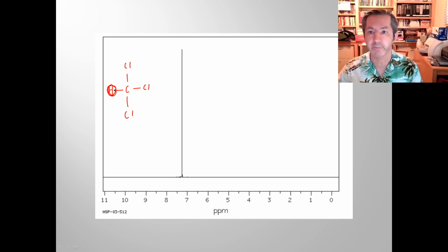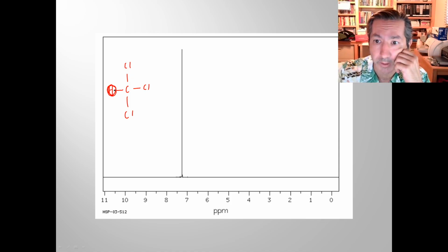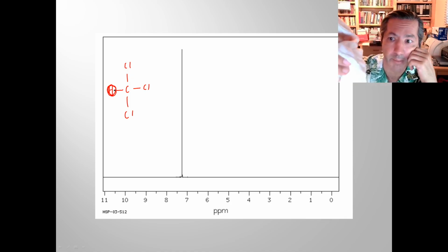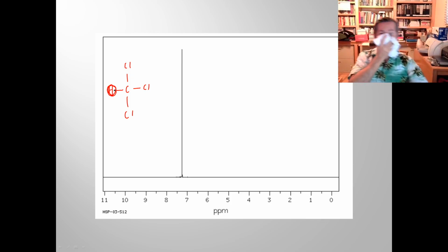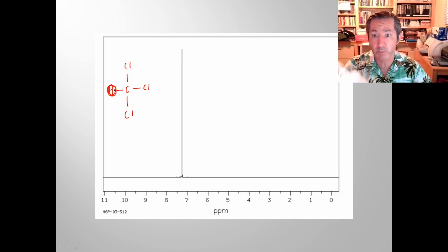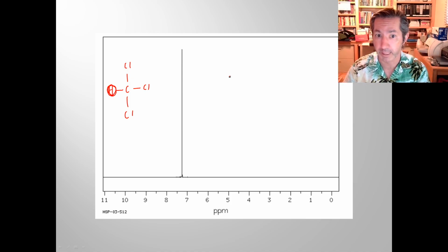It also goes by a different name. You might see this in some detective novels or old-time movies. Someone might be sitting there working at the computer, and then someone sneaks up and says, hey, where's that handkerchief coming from? Oh my God, it's soaked with chloroform. Someone's trying to kidnap me. That's what that is, chloroform right there. It's also a common NMR solvent. So chloroform is used many times to dissolve the compounds that we're looking at.